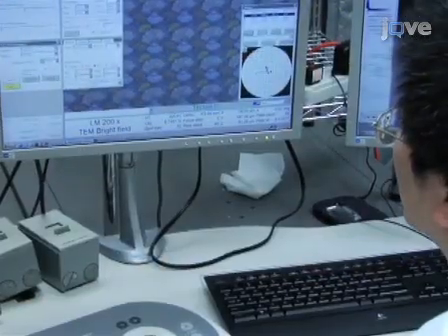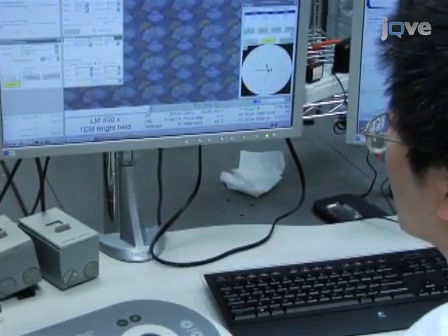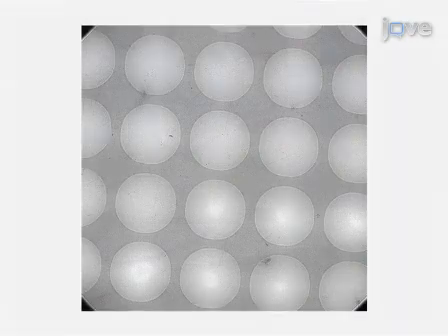Recall the saved positions and further screen these areas at a magnification of 3900x in low-dose search mode. Select the areas with uniform thin layer ice for data collection, which are characterized by containing long tubes suspended over a hole. Save all the areas in a second stage file.